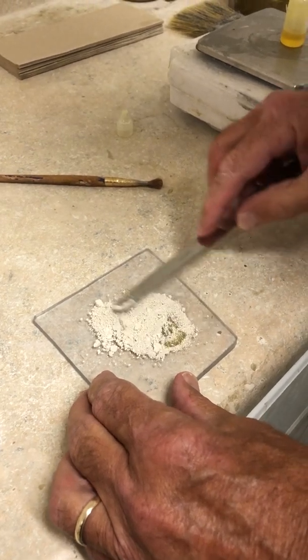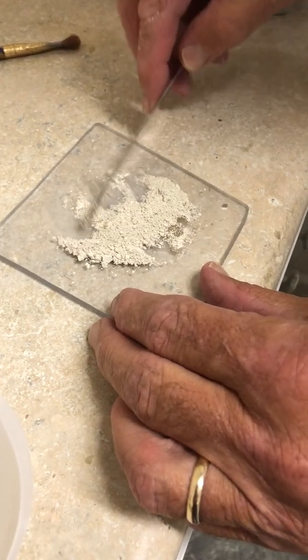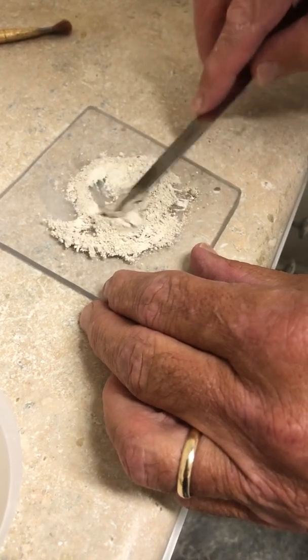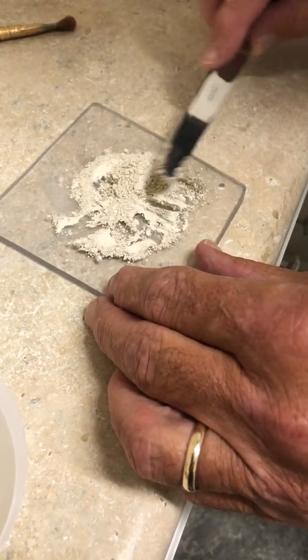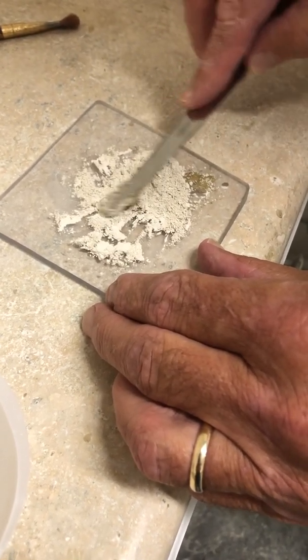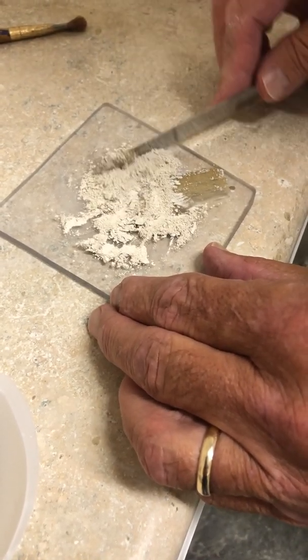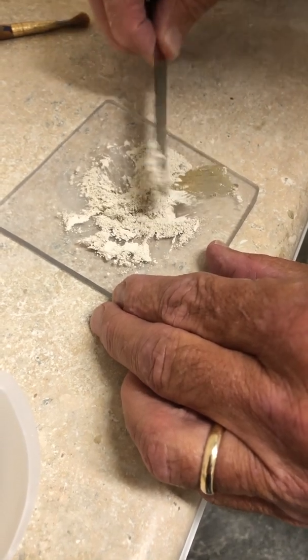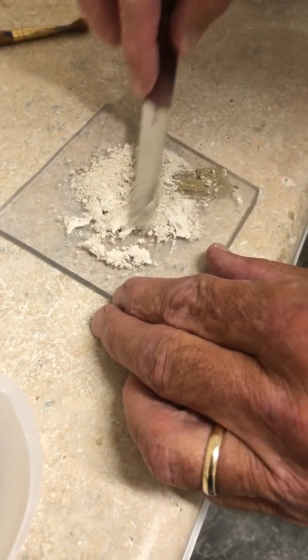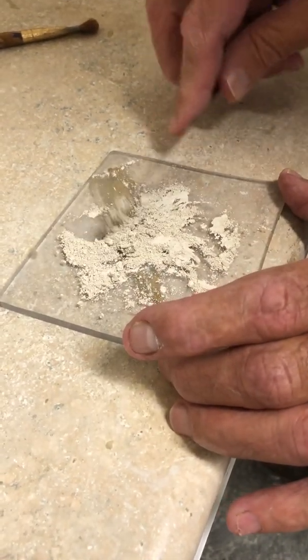We're just going to work this oil and powder in together. When you get done, you'll have more of a putty-like substance. It's important that you don't lose any of this powder — that could affect your results. Get close to the edge here.